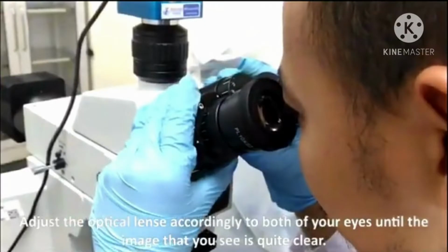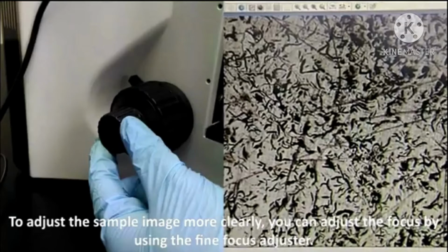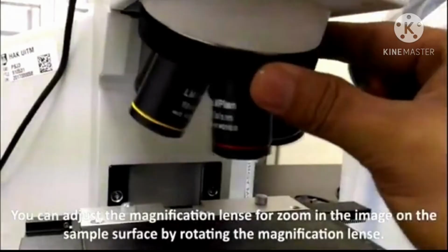Adjust the optical lens according to both of your eyes until you can see the image clearly. Then bring down the workstage by adjusting the coarse focus slowly until the image of the sample appears on the computer interface. To adjust the sample image more clearly, you can adjust the focus by using the fine focus adjuster. You can also adjust the magnification lens to zoom in on the sample surface by rotating the magnification lens.